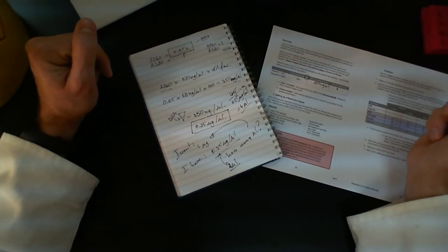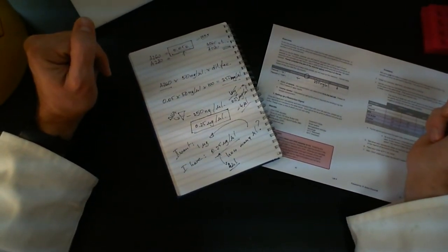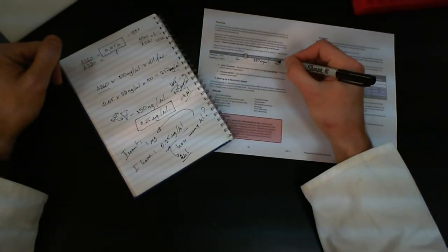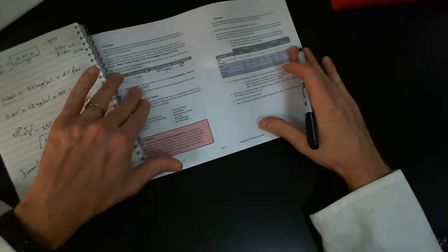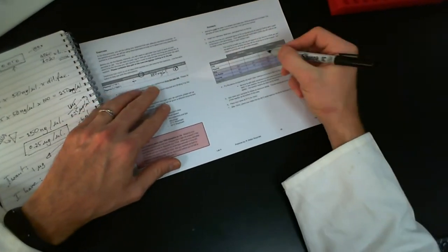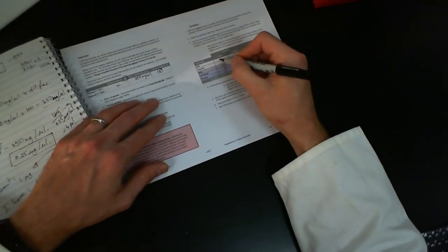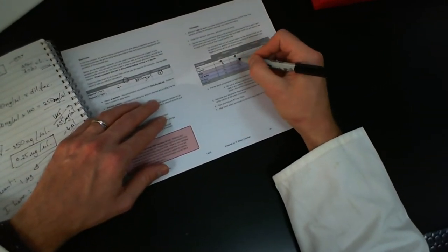Again, you're going to do the calculations for yourselves based on your numbers. Once you have this number, you are going to plug it in here. So let's say this is my plasmid 1, then I need 4 microliters of this in this digest, and for this digest as well. Oops, that's not 4 microliters in here and in here.